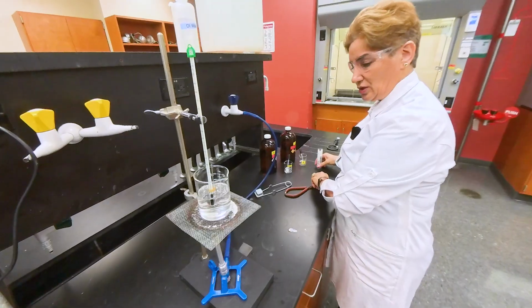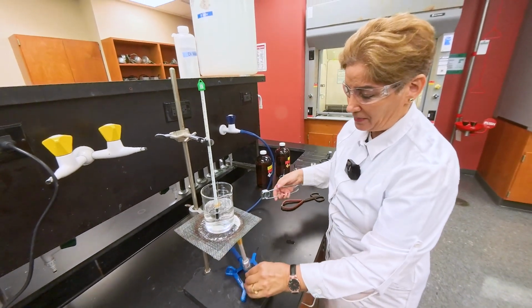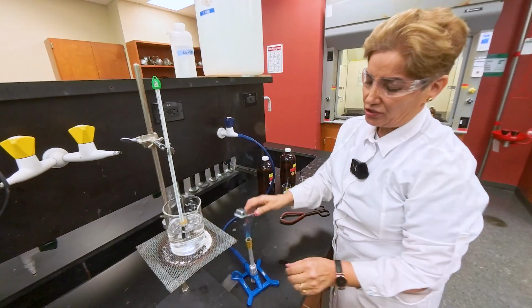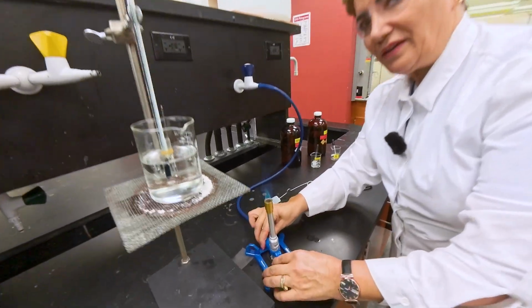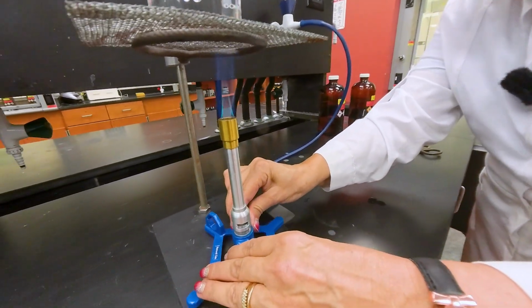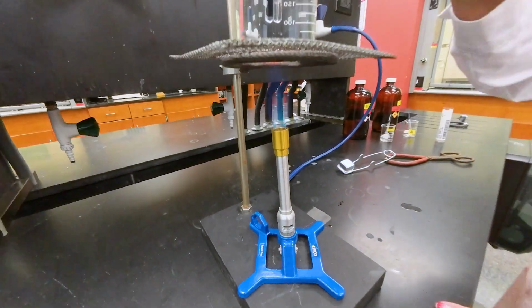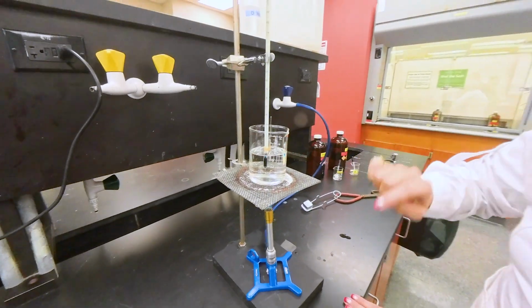Then you already know how to adjust the Bunsen burner. You turn on the Bunsen burner, adjust the level of the oxygen, place it underneath, and wait for the sample to start boiling.